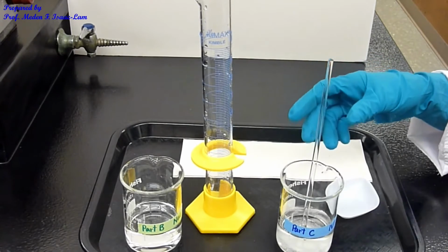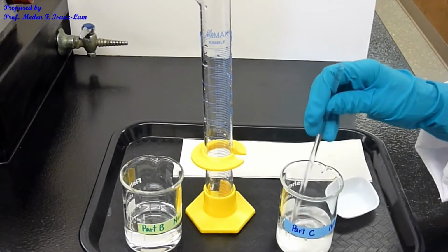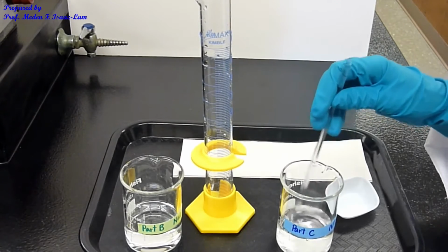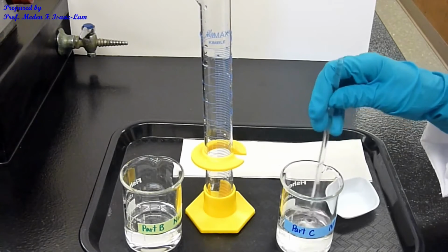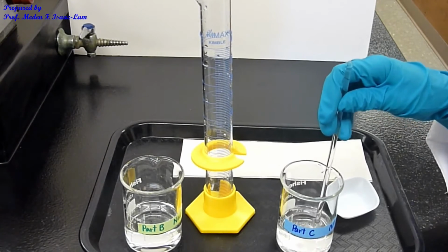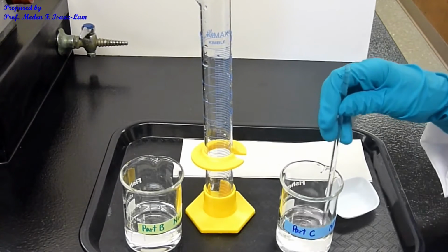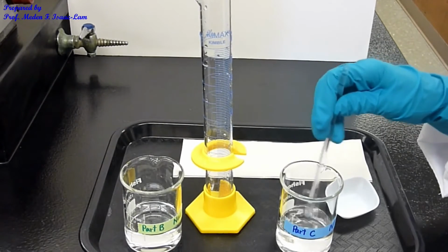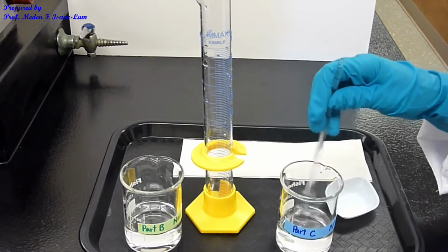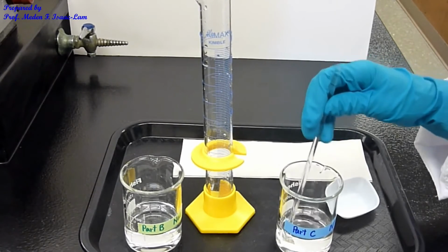So glucose is a sugar. It's one kind of a sugar. You're gonna learn this later in the semester when we talk about biochemistry. It's different than sucrose. Sucrose is the table sugar. Salt, NaCl, is the table salt. Your sucrose and glucose are different. Okay, they're not the same. They're not the same structure. They're both sugars or carbohydrate, but structurally they are different.